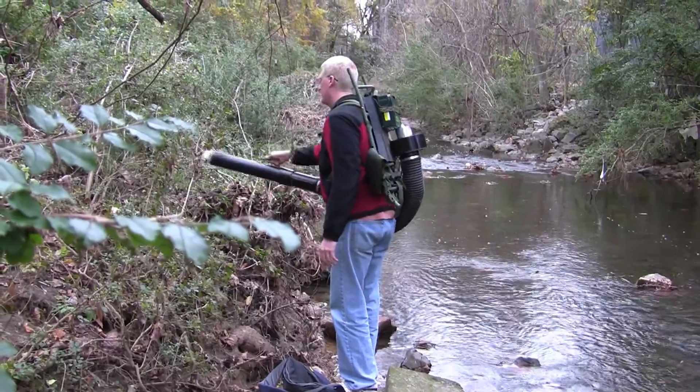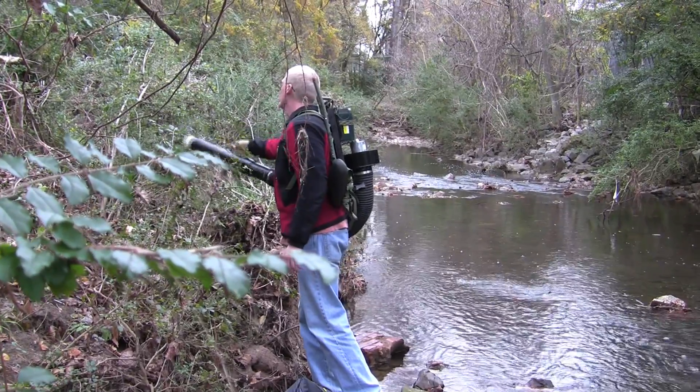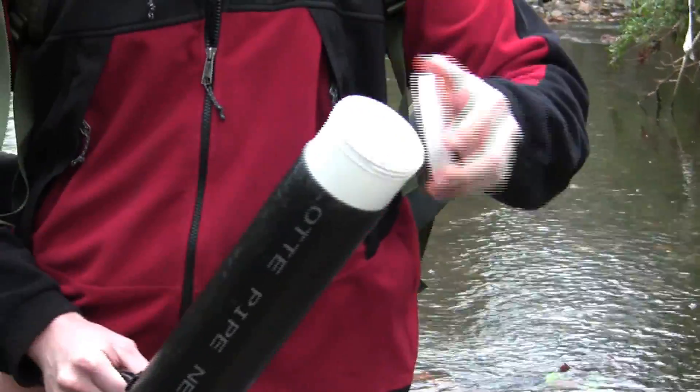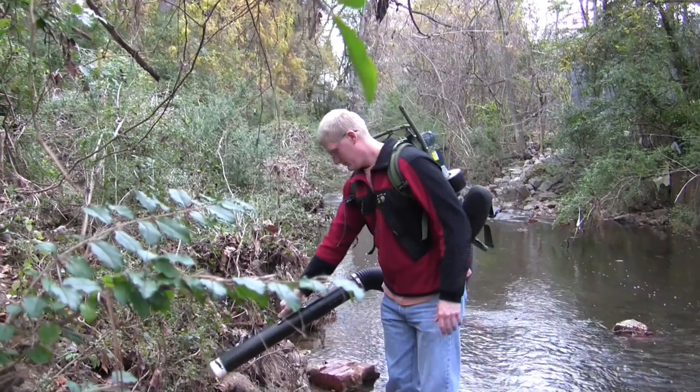The most commonly used method is the CDC backpack aspirator. It's basically a heavy and big backpack that has a motor mounted in the back. That motor creates a suction channel that aspirates mosquitoes into a collection cap. It's really heavy — we are talking about 24 pounds. It's also very expensive, between $500 and $700. Another limitation is accessibility: you can only reach up to one and a half meters from the motor.